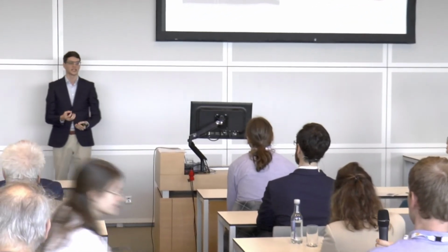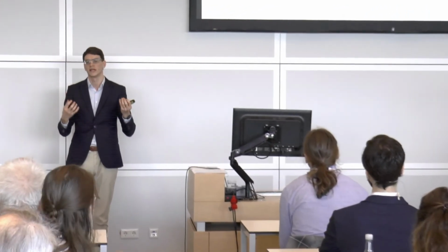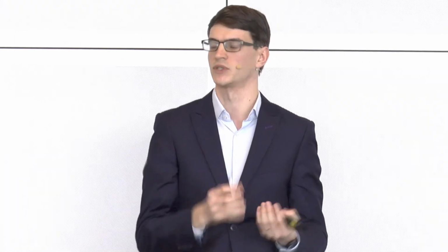So it's a very interesting question, because of course we're not looking at the protein itself, but we're looking at the fluorescent protein that we fused to this protein of interest. Now, this distance is very small. It's in the order of 2 to 3 nanometers. So this is actually within the error of the localization position that we can achieve. Nonetheless, we have to account for it, especially in our biological systems, because of course we're technically not studying our protein of interest, but we're studying a kind of different protein that we adapted in the laboratory. So we have to take into account that it's slightly larger, and we can maybe have different interactions that we previously wouldn't have expected.